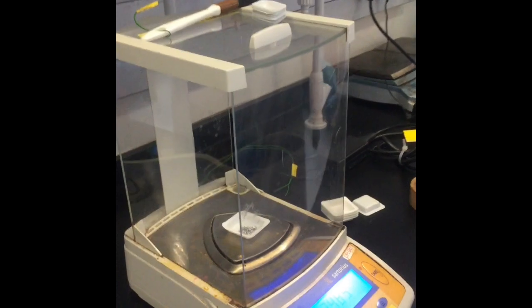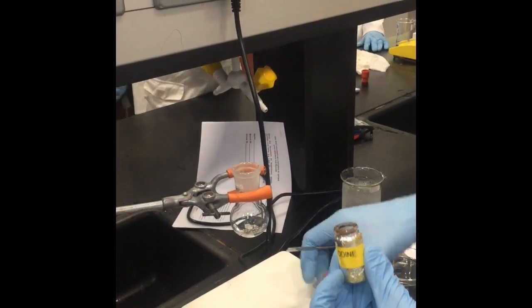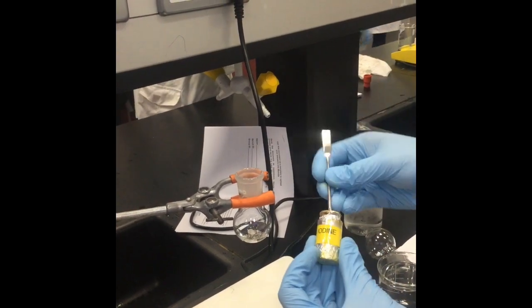Once the magnesium turnings have been placed inside the round bottom flask, add a few iodine crystals into the reaction and watch the color change as the reaction starts.